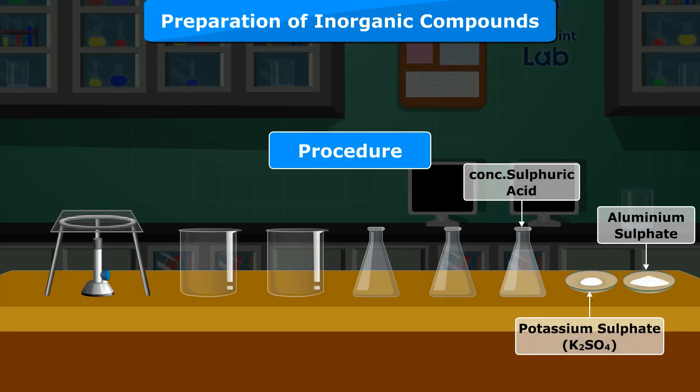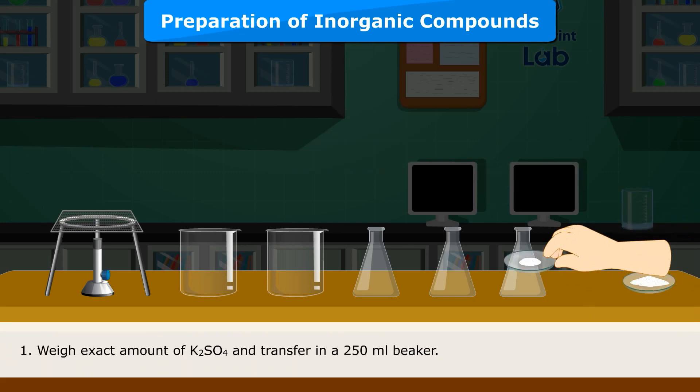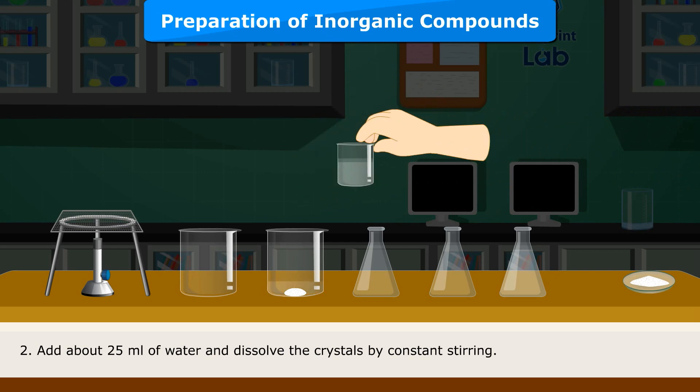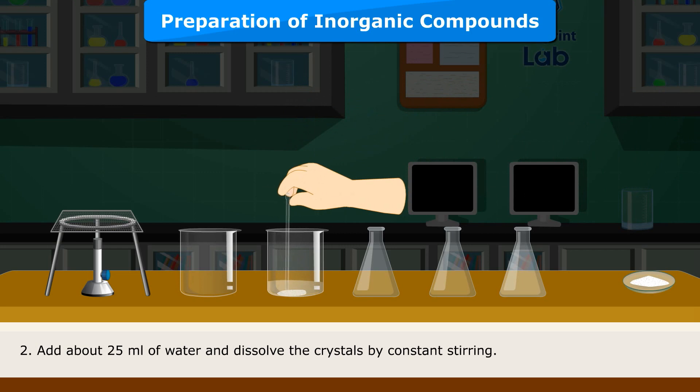Procedure: Weigh the exact amount of K2SO4 and transfer it into a 250 ml beaker. Add about 25 ml of water and dissolve the crystals by constant stirring.